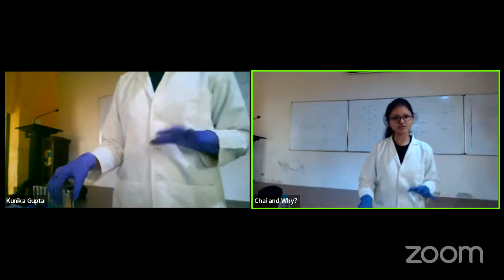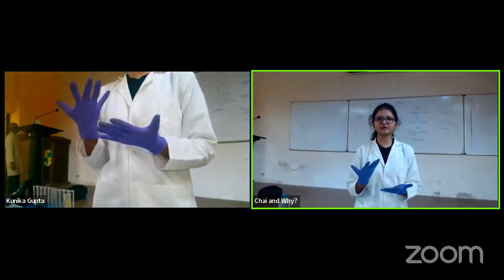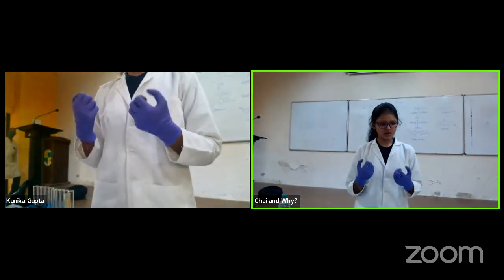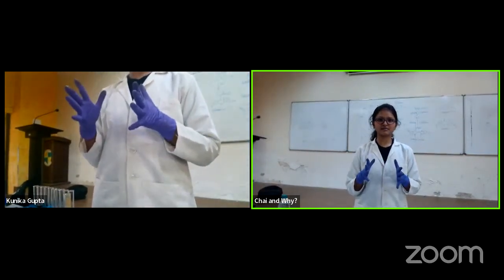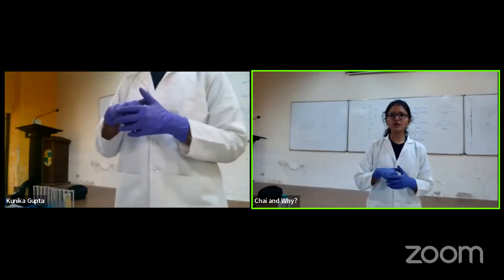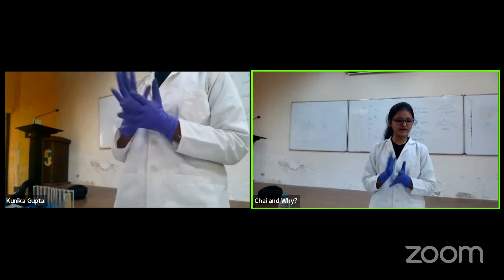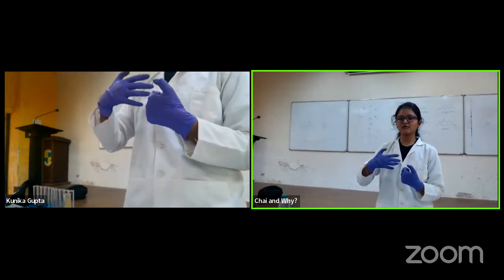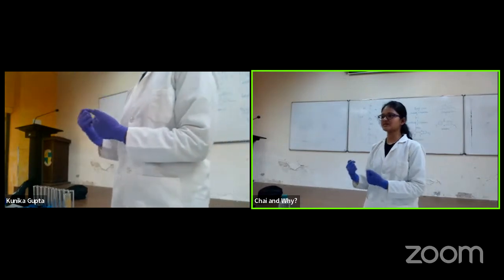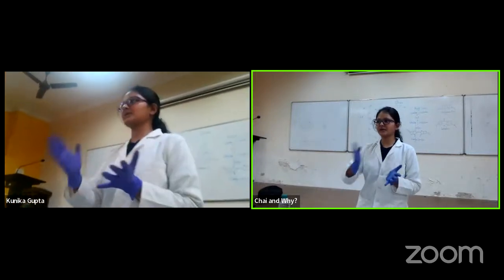Fine. Now I explain what actually has happened. So I dissolved fluorescein in water. It was not active. It was in quenched form. When I added acid to it, it was still like that. But when I added base to it, it gave me a turn on response. So fluorescein is a dye which fluoresces in the presence of base and not in the presence of an acid. So what I can detect from it is an acid and a base difference.